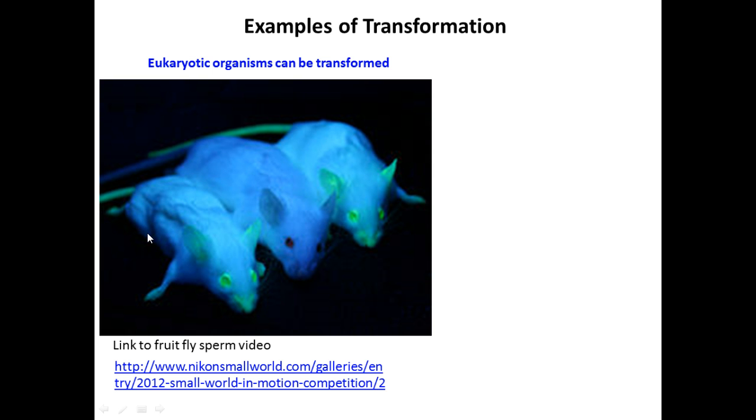This is because when they were embryos or single-celled zygotes, they transformed them by adding additional DNA to produce this green fluorescent protein. A lot of times they do this to tag them so they can tell if the process worked, right? Because you can't just look at an organism and know that its DNA has changed unless you give it something visual that it can make from DNA that you can visualize. So in this case, green fluorescent protein.